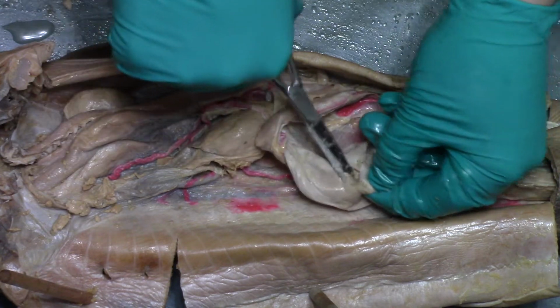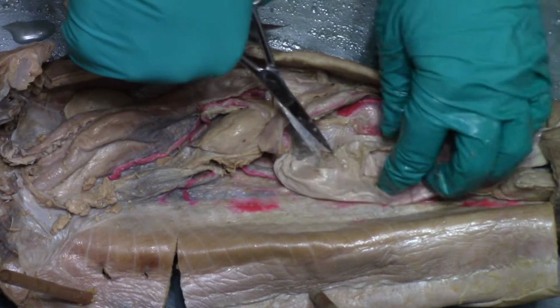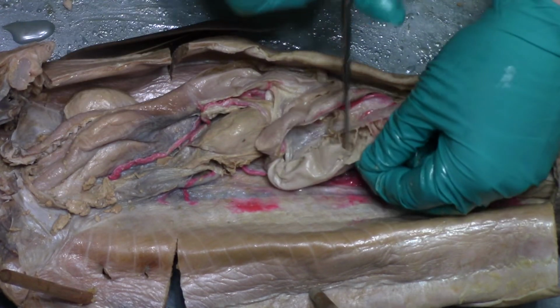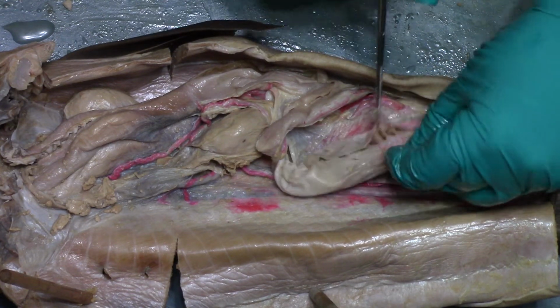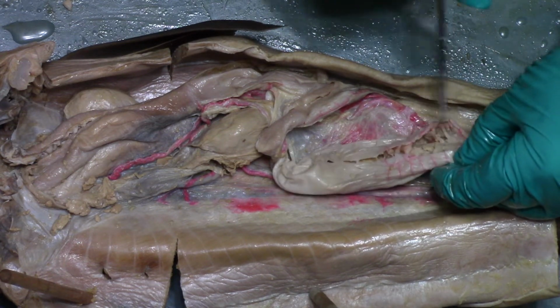Oh. Starting to smell a little bit too. But yeah. So this part of the intestine has these chambers with valves in them, which is pretty cool.